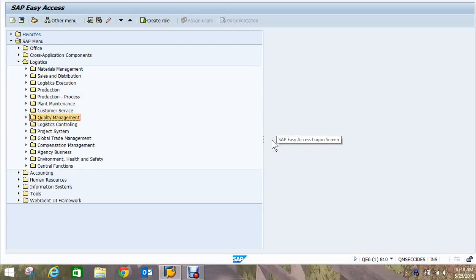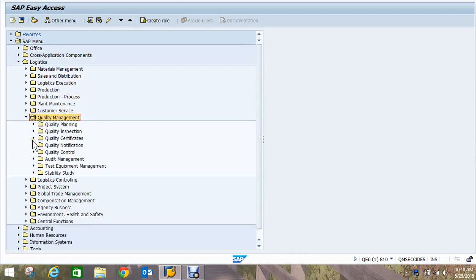Oh, my name is Doug Timbrock. I'm going to be looking at, in this video, a portion of SAP QM Sample Management. We're going to be focusing on the retain or reserve sample portion of the sample management. We'll start with looking at the master data required.